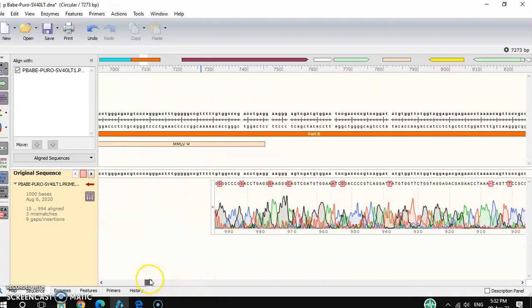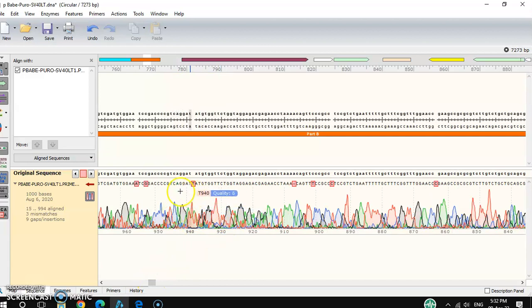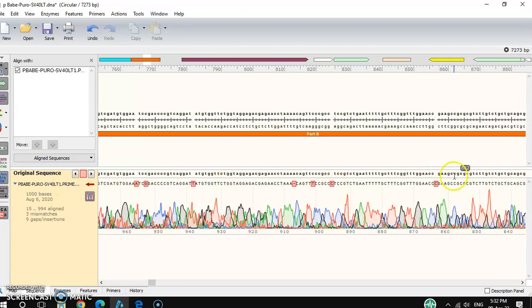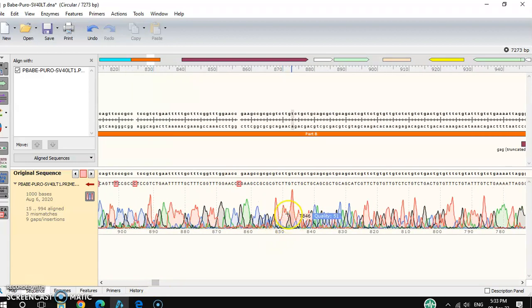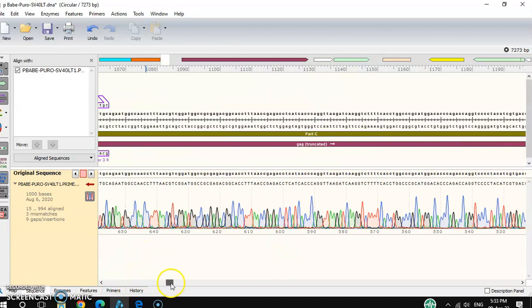In the ending part, if you check carefully, there are a lot of overlapping peaks and many apparent mutations. You can see these parts are around positions 857 to 860 — almost the end of the reliable sequencing range. After position 850, up to position 993, you cannot rely on this part of the sequencing result, so you need to use another primer to cover that region.